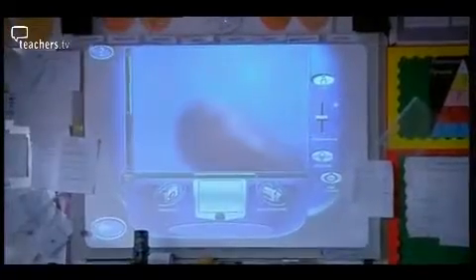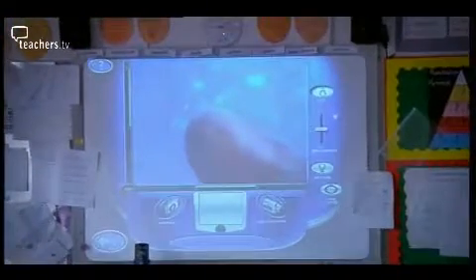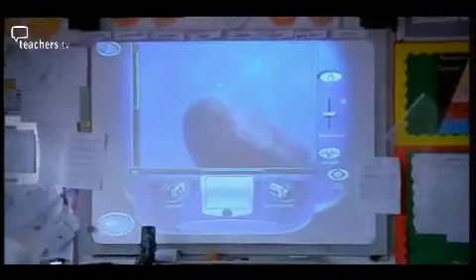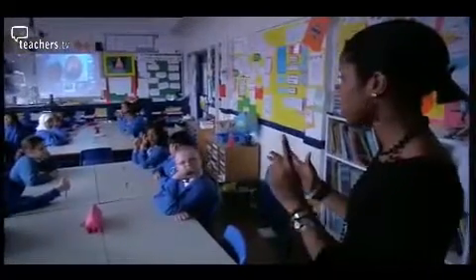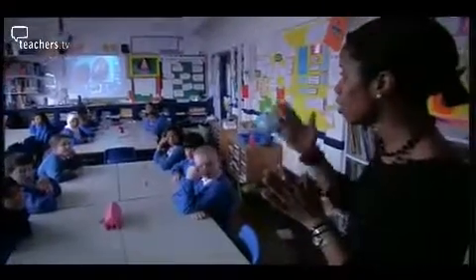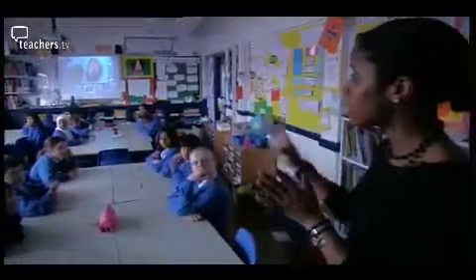Let's first of all have a look at these seeds under the microscope. Okay, that's been magnified 60 times, so it looks much bigger. The class will be able to explore life cycles by tracking the stages of growth as the seeds germinate. But also we want to think about how long do we want to leave in between our snapshots.